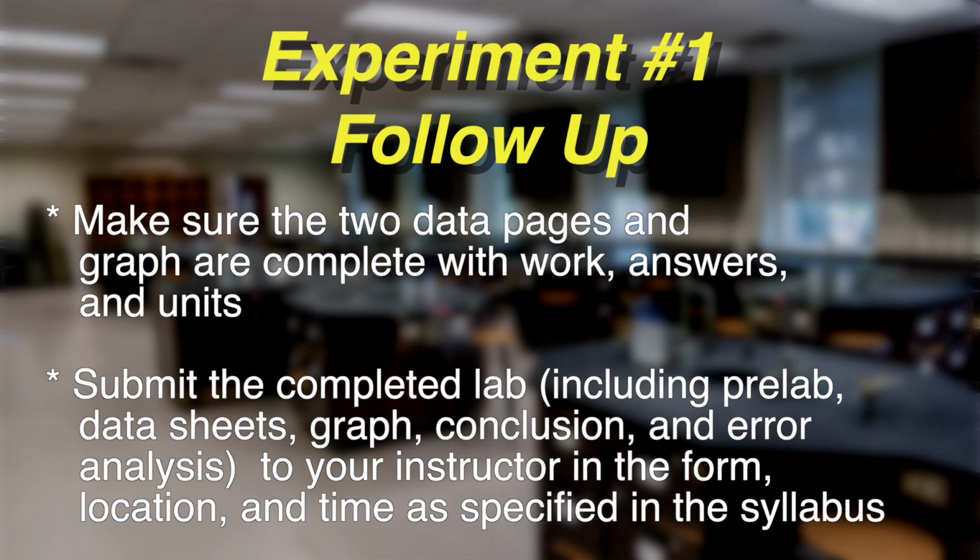For example, no one needs to know the initial and final burette readings, or even the volume of the solutions here. What's really important are the densities and mass percent water. Always include unknown numbers. Finally, you will need to complete the error analysis, which are the 2 questions at the bottom of the data sheet.